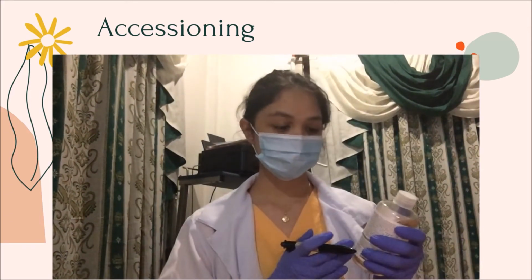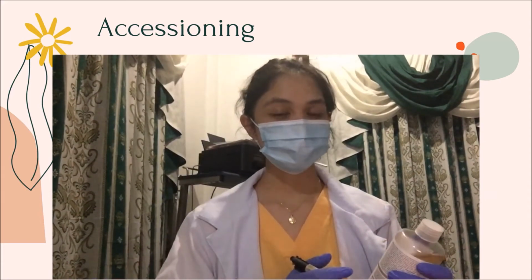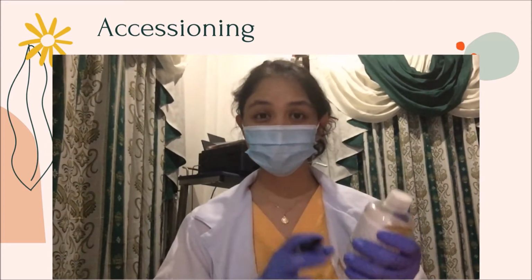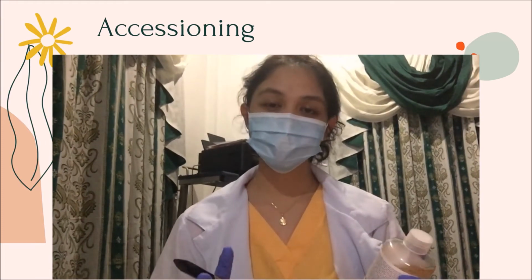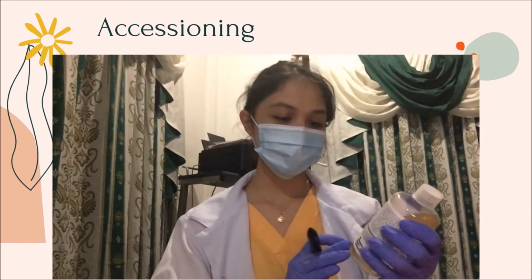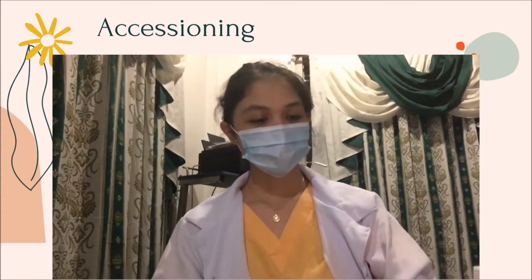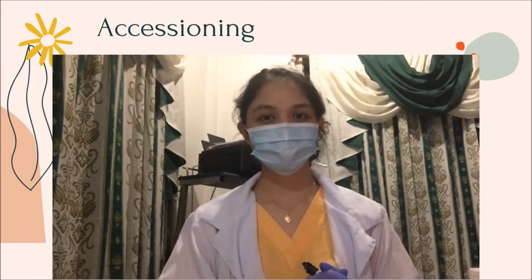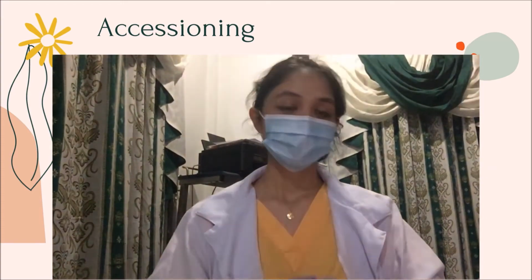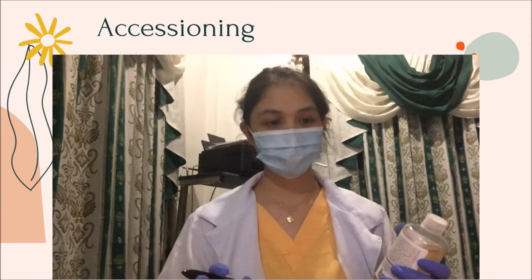So going back with the label of this specimen, which is SP21143, again SP for surgical pathology, which means that we are dealing with a live patient. And then the 21 here stands for the last two digits of the current year, 2021. And then the next number is 143, which is our control number. So say for example, you have received two specimens from the same patient. So to avoid confusion, you're just gonna assign a specific letter after the control number.